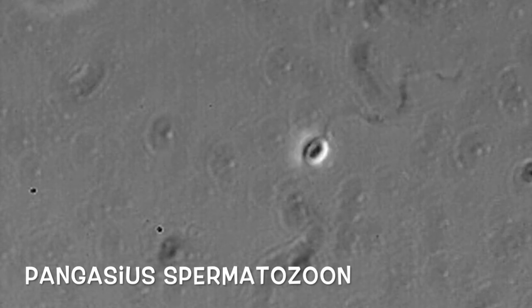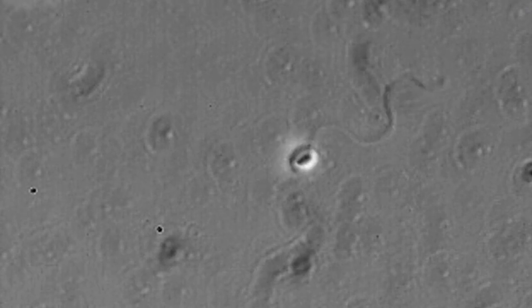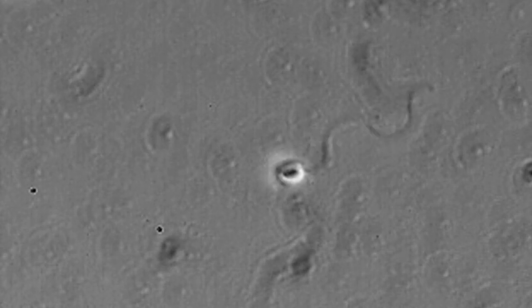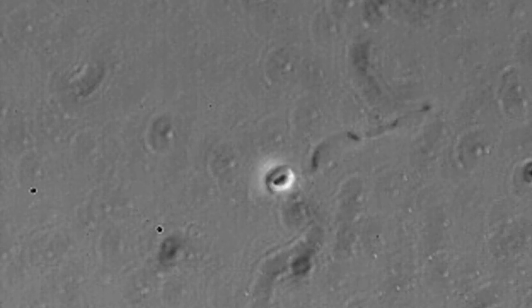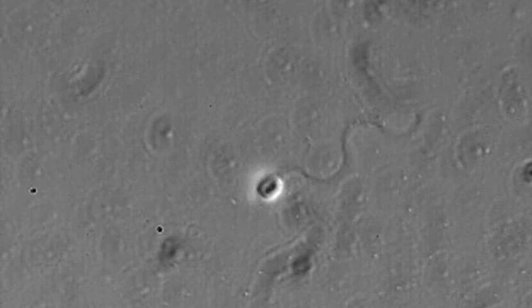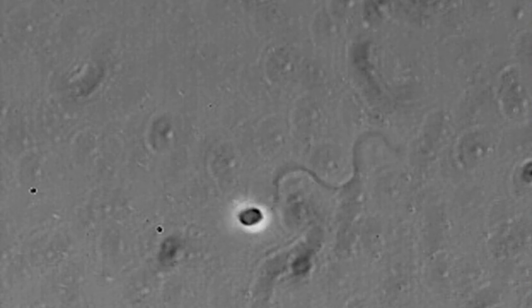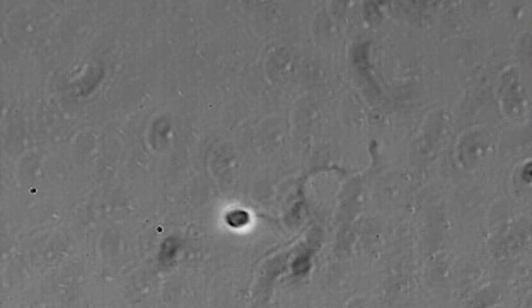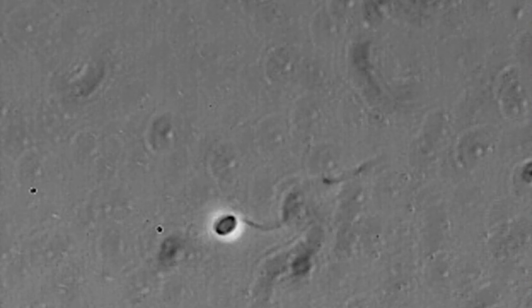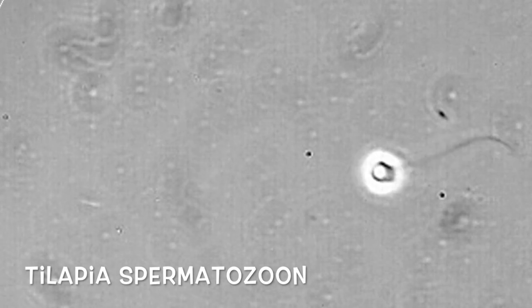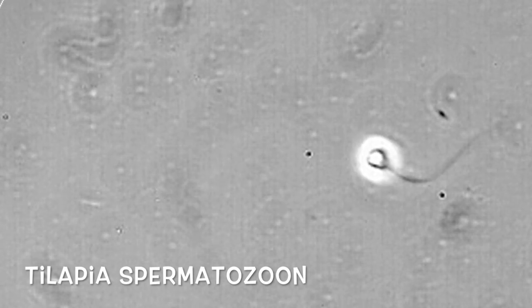This is Pancaceous spermatozoa. And this is a spermatozoa of tilapia.